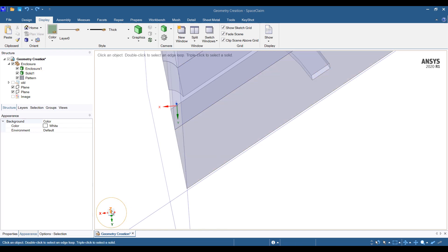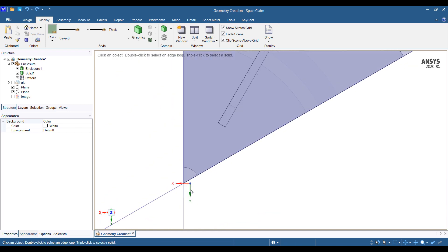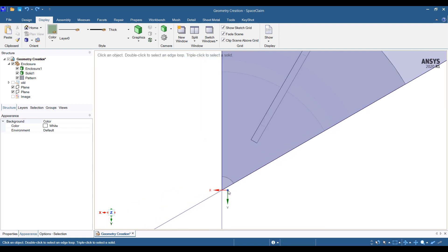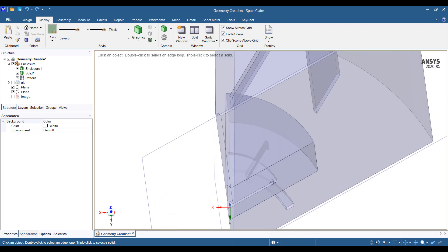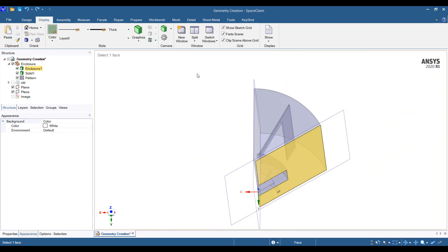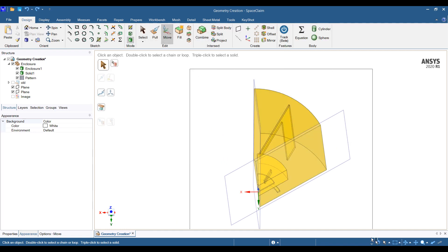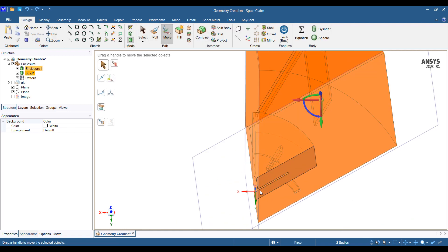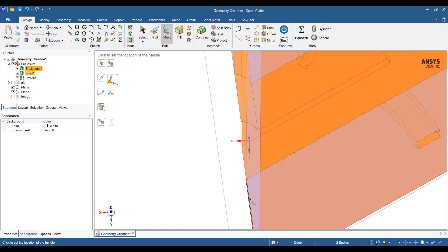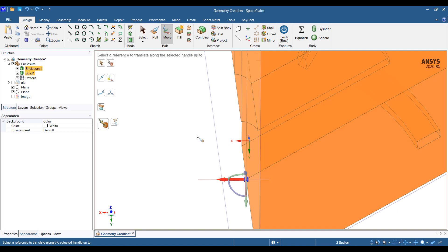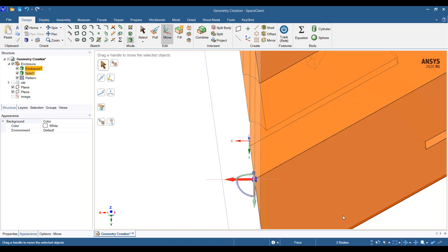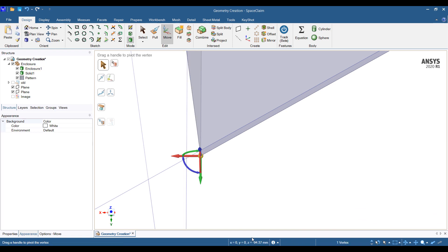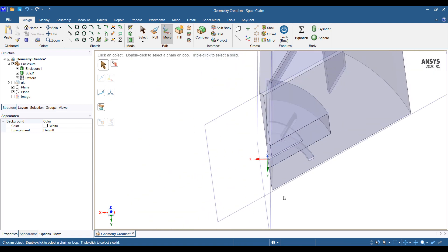Probably should have done this earlier, but you can see that our z-axis doesn't, our rotational axis doesn't quite line up with the global axis. We can certainly use it as it is, but let's make it a little bit easier for us. So let's do a move, and we're going to put this here, and we're going to move this up to the global axis. Double check. If we click on this point, you can see that the x and y plane is 0, and z is at minus 94. So everything is lined up and we're ready to run some simulations.